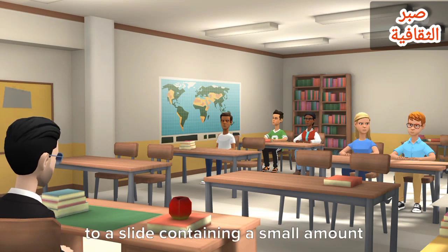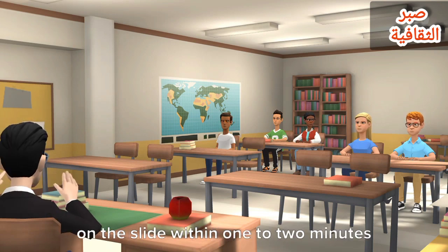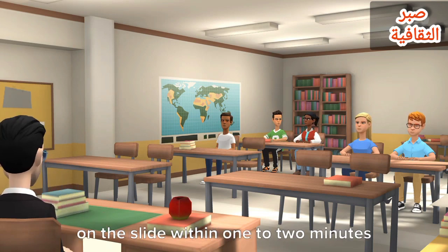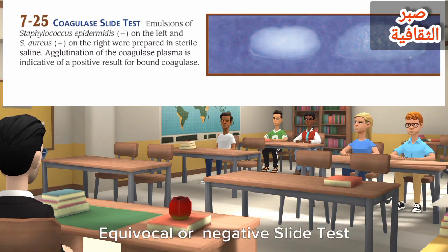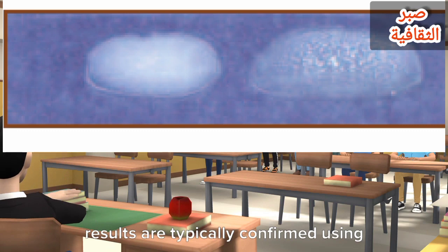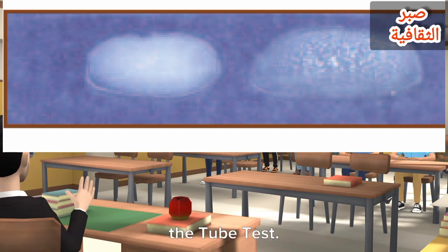In the slide test, bacteria are transferred to a slide containing a small amount of plasma. Agglutination of the cells on the slide within 1 to 2 minutes indicates the presence of bound coagulase. Figure 7-25. Equivocal or negative slide test results are typically confirmed using the tube test.